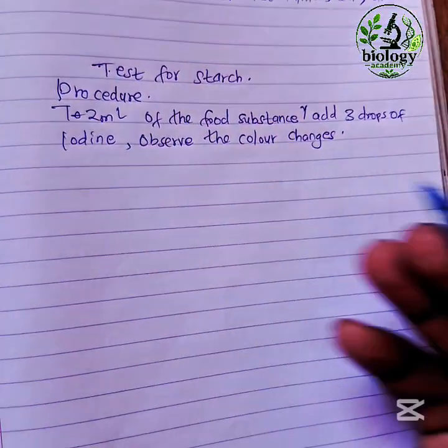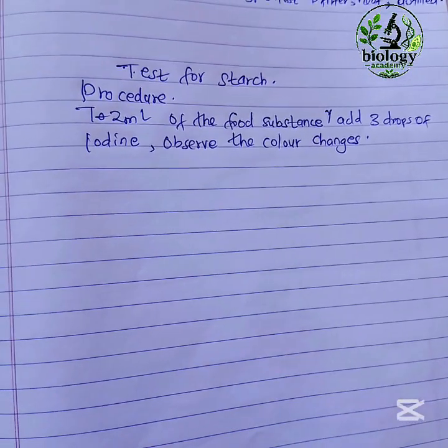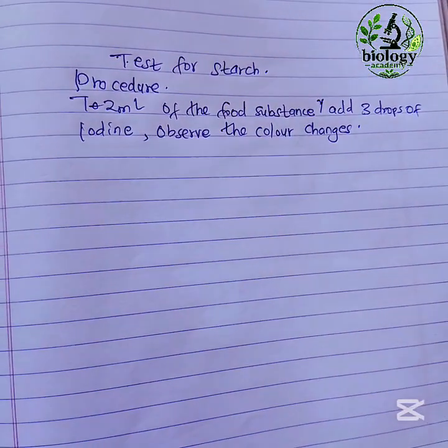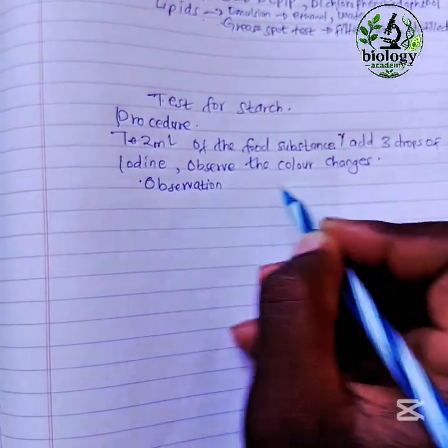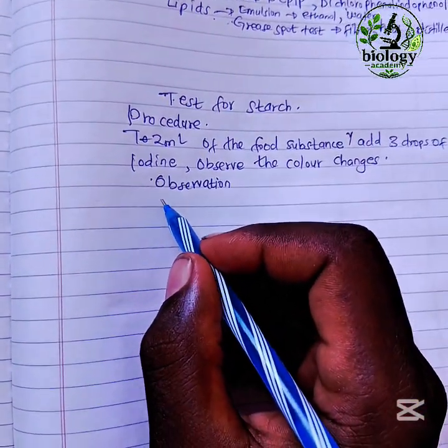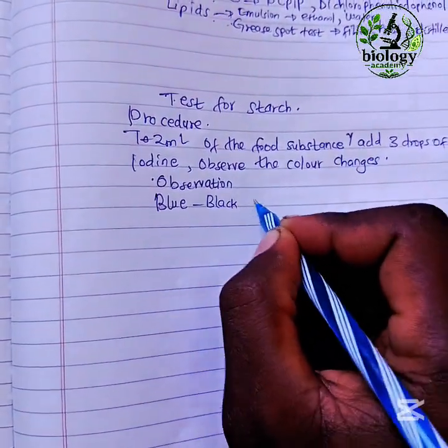It is constant throughout. The procedure will never change. What you need to understand is that if you write the wrong procedure, you get the wrong observation and the wrong conclusion. So we also have the observation. There might be a negative observation and a positive observation, whereby if there is presence of starch, you'll see a blue-black color change.